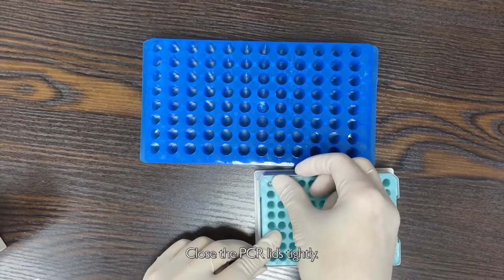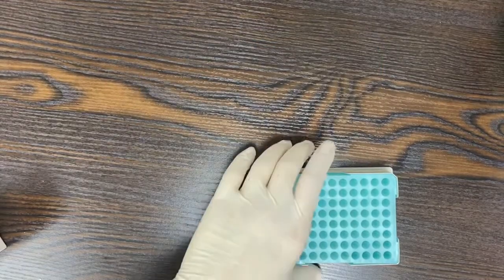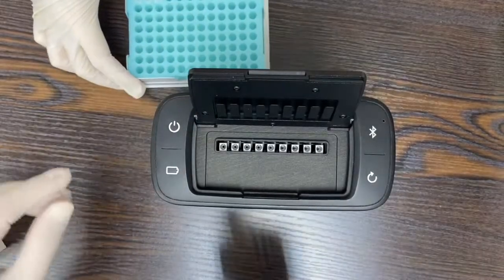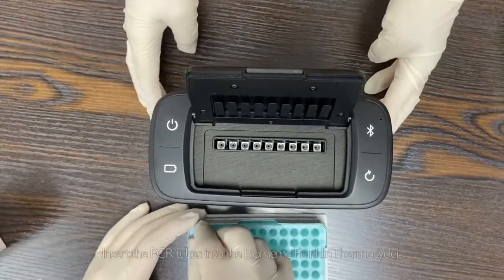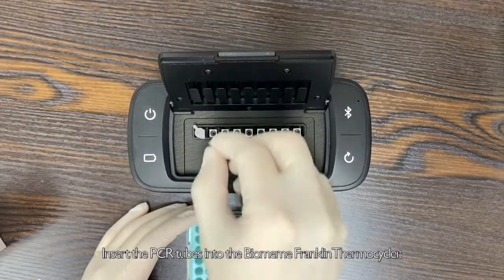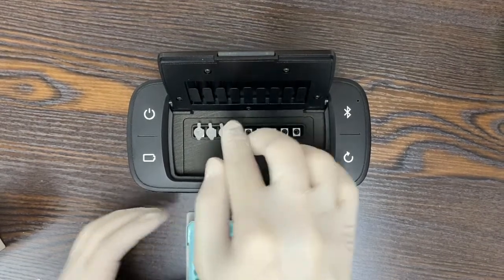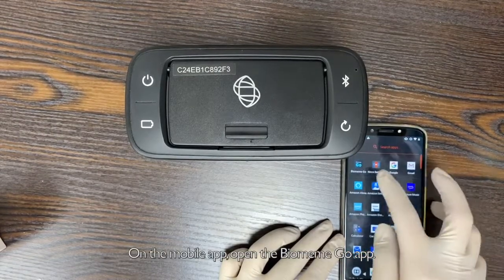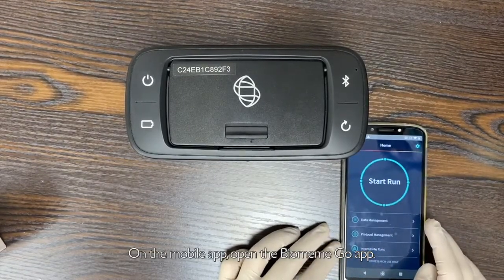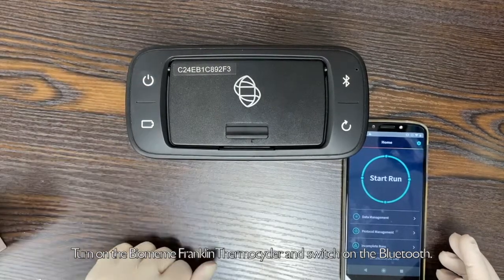Close the PCR lids tightly. Insert the PCR tubes into the Biomeme Franklin Thermocycler. Turn on the Biomeme Franklin Thermocycler and switch on the Bluetooth.